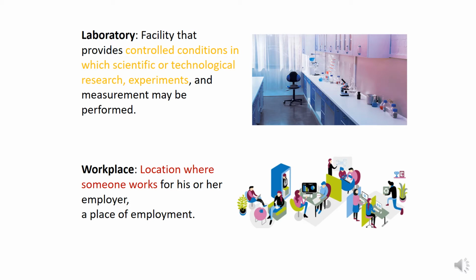So, what is a laboratory? A laboratory, or lab, is the facility or place that provides controlled conditions. Under those controlled conditions, we can do some scientific or technical research, whether this is undergrad, postgrad, or PhD level.